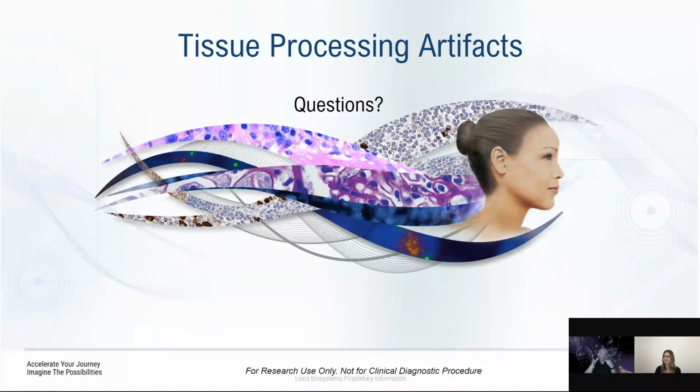We would try to prep it as minimally as we could, but be able to create spaces where the fixation could get in and do its job, because you've cut off that blood supply. So on a cellular level, we're going to see changes and the beginning stages of autolysis, which in turn destroys your markers. RNA's gone, right? I could talk about this all day long, because this is probably the most important step: getting the specimen as quickly as possible into the right fixative for a good amount of time, but also allowing it to get to everything.